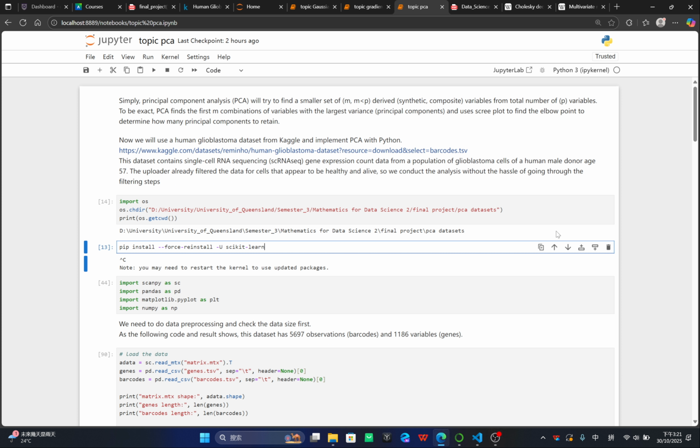Hello everyone, my name is Jiajun Li, and today I will demonstrate how to perform principal component analysis, which is short for PCA, on a single-cell RNA sequencing dataset.